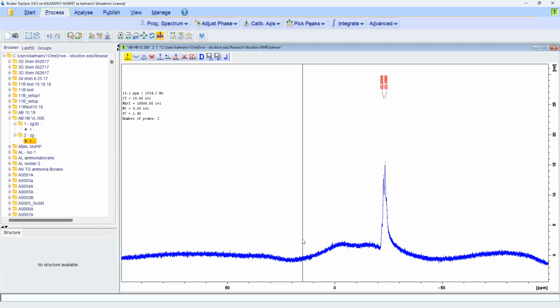Now, there are times that you might have phosphorus. Phosphorus would be processed in a similar way. With the phosphorus NMR, though, the phasing should be fine. You shouldn't have to worry about the phasing for that. But like boron, for phosphorus I'm not going to have us use an internal or external reference for the shift.